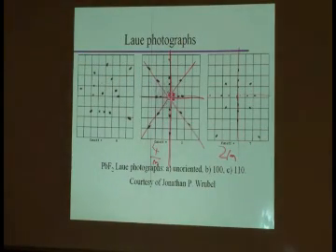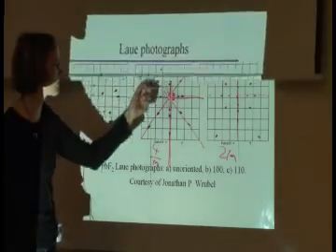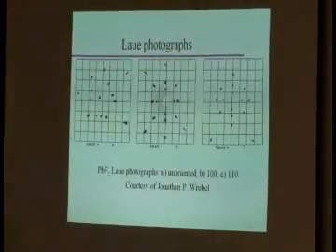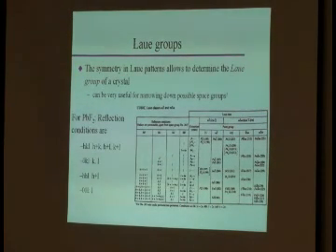So we've identified the Laue class of our PbF2, haven't we? It's m3̄m, because we see 4-fold symmetry in the 100 and 2-fold symmetry in the 110. Now, why would anybody care? It's a good question, right? Because it might be on the exam, that's a good answer, but why would anybody care in real life?